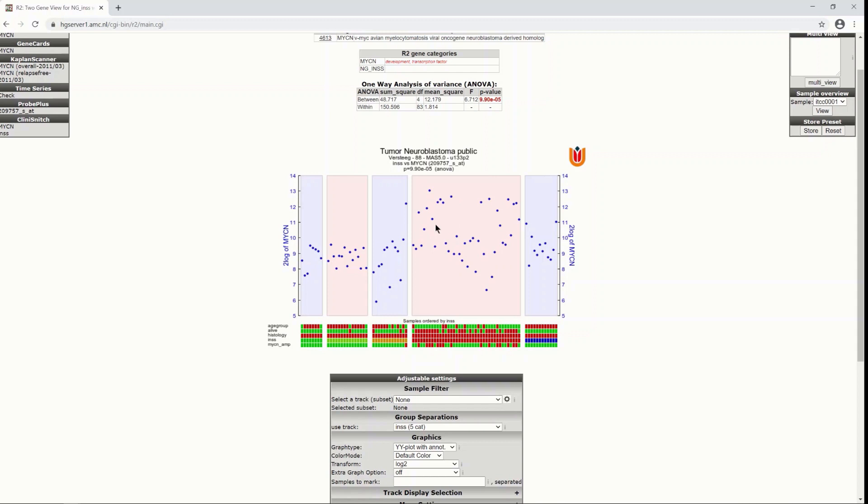Also you see on top of the graph a table that shows you the one-way analysis of variance results and you see a p-value that shows a quite significant result.